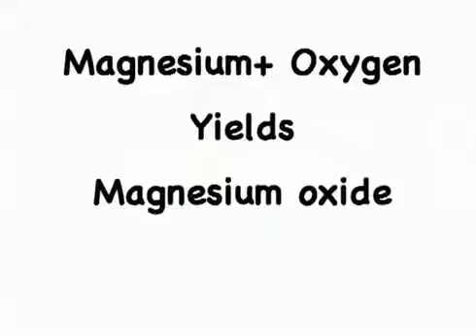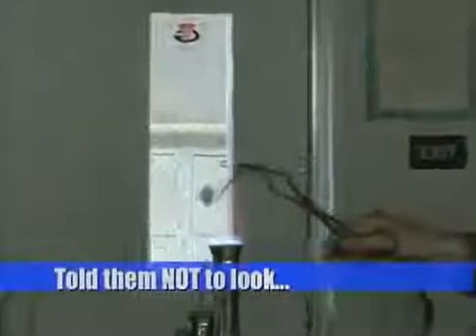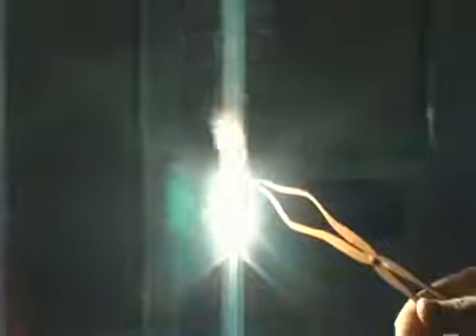We'll balance magnesium plus oxygen yields magnesium oxide. Don't look directly at the light. Oh, that's awesome. I told you not to look directly at the light.